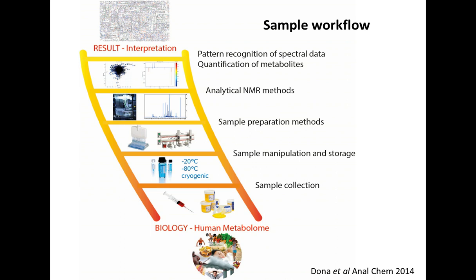So sample workflow is very important. There have been various publications from various groups on this, but we basically follow Bruker's protocol, and the whole philosophy is described in an article by Dona et al.